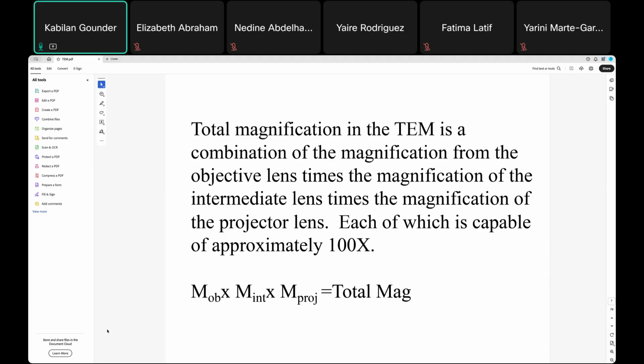But because we wanted to visualize it, we magnify it this many times so that we can tell the scientific community, or whoever wants to see it, that this is the organelle. When we increase the magnification up to 300,000 times, this organelle is shown at a magnification of 300,000 times. That is how we can convey this information to others so that they will understand.